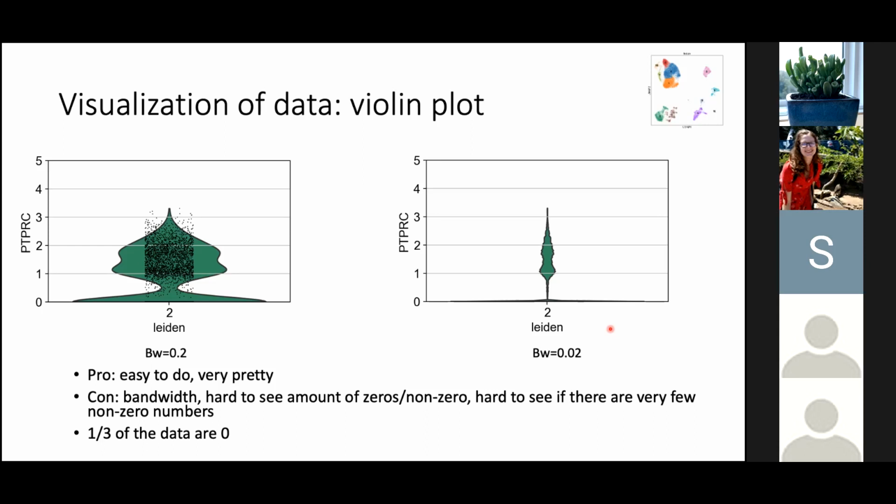To a certain extent, yes, but I do know there are also random fluctuations where one transcript can be expressed. We just saw a paper like that in Journal Club, where just one transcript was expressed. But this is also a consequence of the log normalization you're doing, right? It could shoot all the way down to 0 if it's just a few counts.